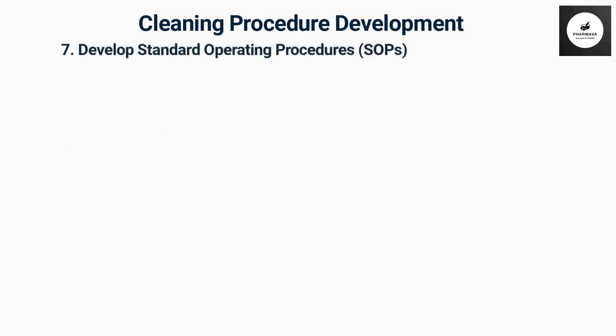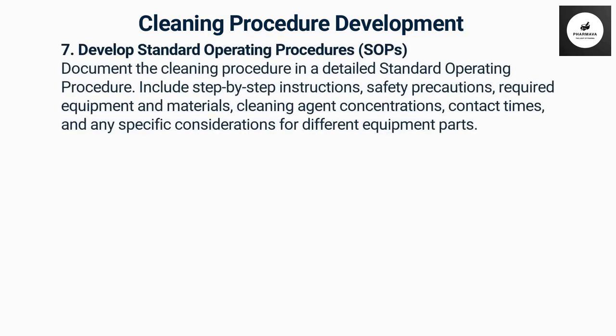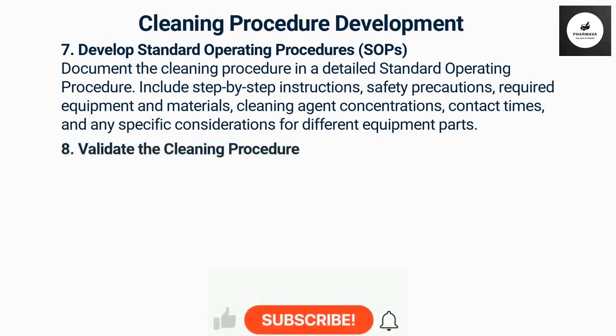Develop standard operating procedures. Document the cleaning procedure in a detailed standard operating procedure. Include step-by-step instructions, safety precautions, required equipment and materials, cleaning agent concentrations, contact times, and any specific considerations for different equipment parts.